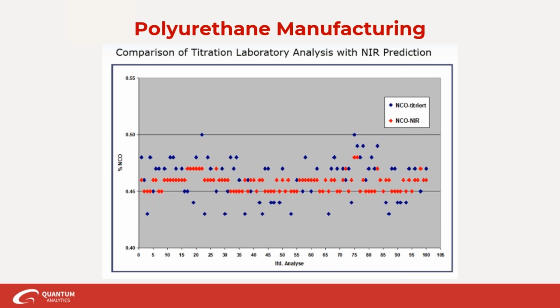If anything, there's more variability in the titration analysis. It's kind of hard to say why that is, but it could potentially be that there's more air in the titration. You pull these samples out, and certainly they could potentially change. And there's a lot of advantages as well. No sampling, it's faster, done in the reaction, and you don't have to worry about your sample changing.